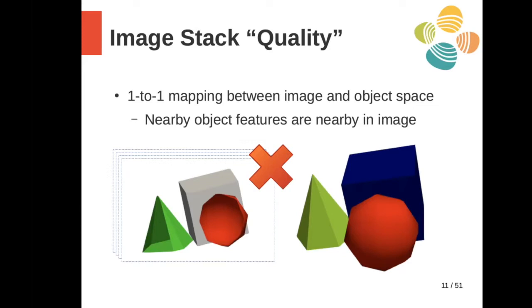That doesn't work. So to make samples work this way, you might be embedding them in something else, like some sort of resin, and prepare them in a way that when you take that slice, there's something preventing you from seeing further into the distance.